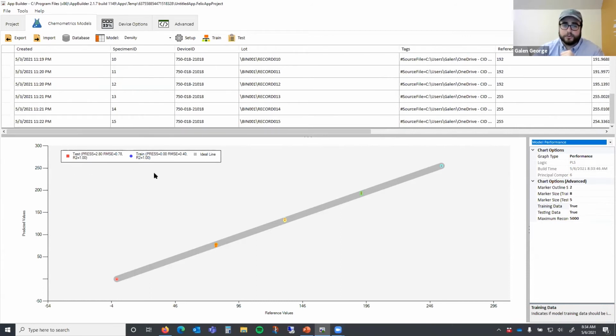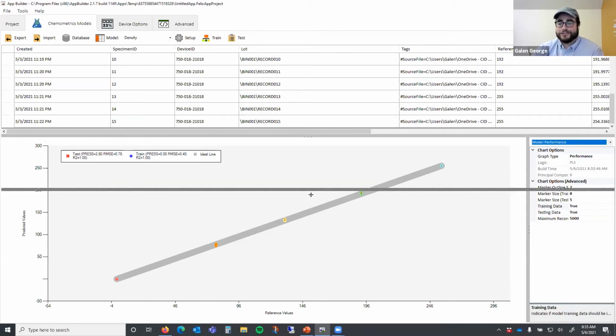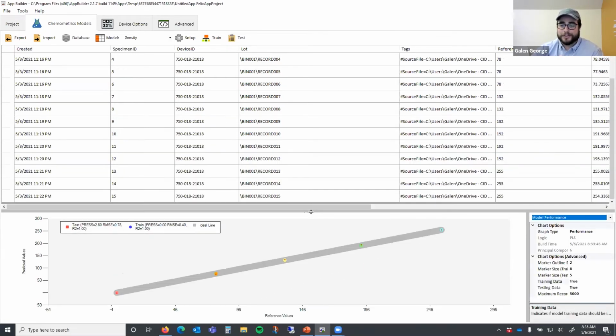The training is our training set statistics, and so this shows you the RMSE and the R-squared. Obviously with this, because everything's so uniform, it's going to look great. The R-squared is amazing because it's a very uniform Teflon block, and the RMSE is also really good. That's simply because we're not measuring any actual biological entity here. It's just inert plastic.